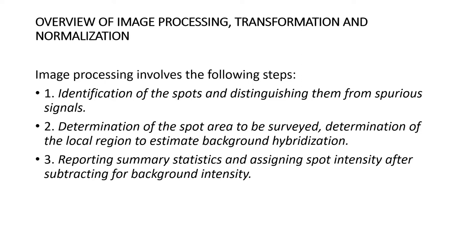So we have to eradicate this effect and solve this problem. So spot area is important. How much area should be considered for the analysis? Wherever the laser beam is positioned on the spots, exactly that spot area should be considered. So it is about the healthy spots.